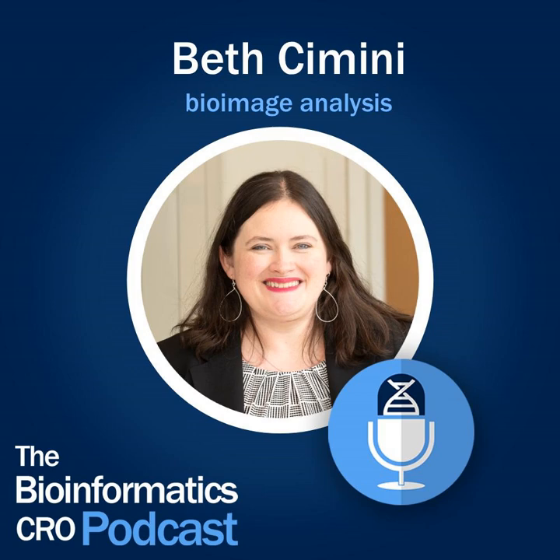I think I know the answer to this, but we always like to echo such things, right? So at what point in an imaging project should someone seek image analyst input? Yes, as early as possible, preferably once you've done your first pilot. And you should definitely be doing pilots with controls. We have a graphic in one of our papers. It's a PLOS Biology paper from 2023. The first authors are Senft and Diaz-Rohrer, where we show the circle of bioimaging and bioimage analysis. And it should be a circle.